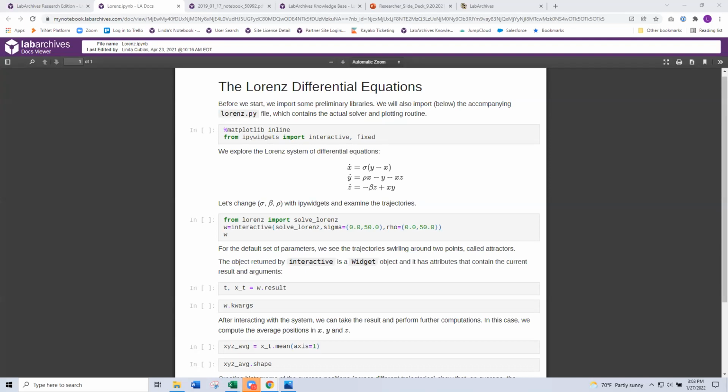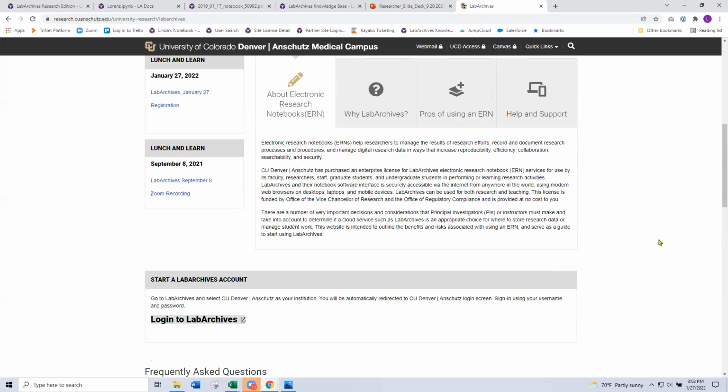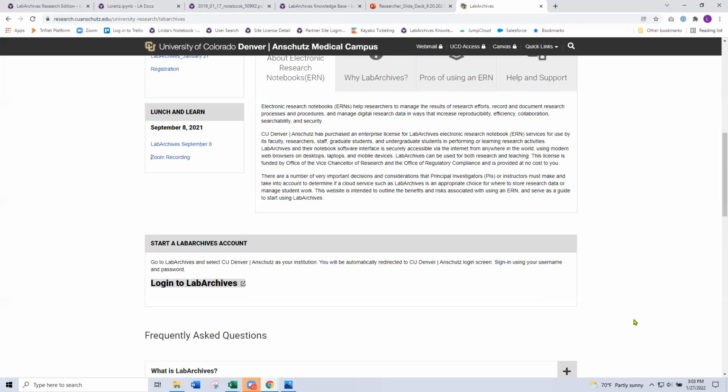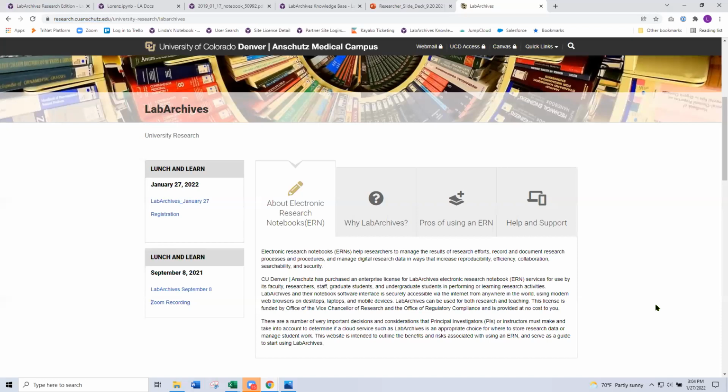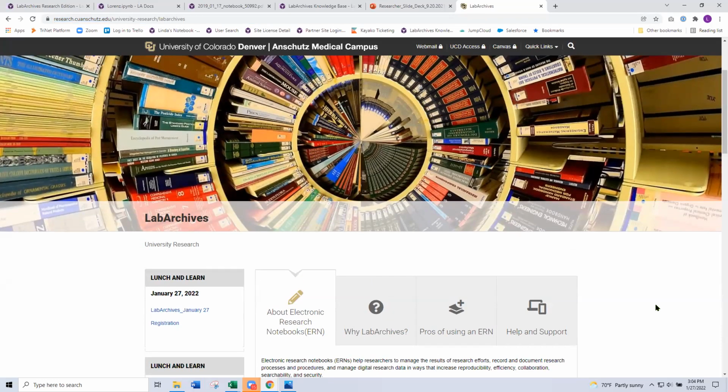And of course, thank you guys. And don't forget about your local resource page here too. And that's the page I'll actually stay with. Just to remind you, you can go to that and all different FAQs are included. It gives you that thorough background in terms of why the university selected LabArchives, its approval, giving you the approval for HIPAA as well.